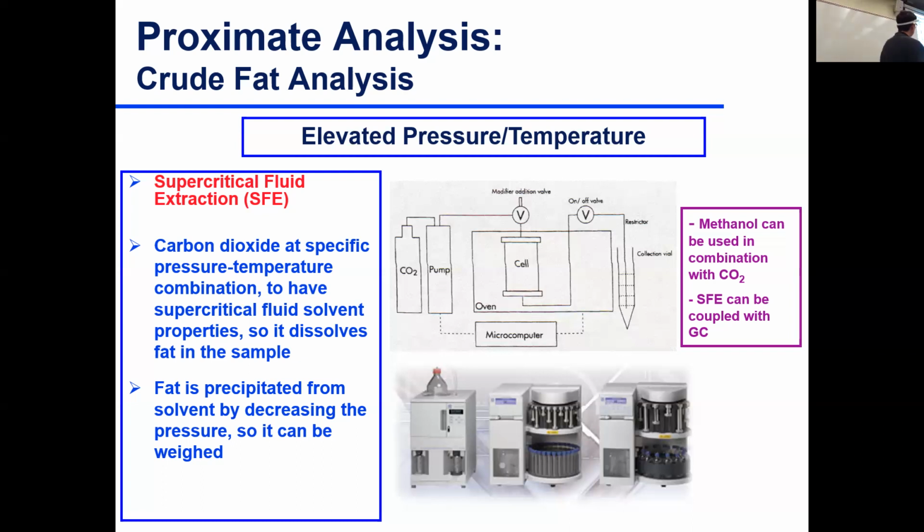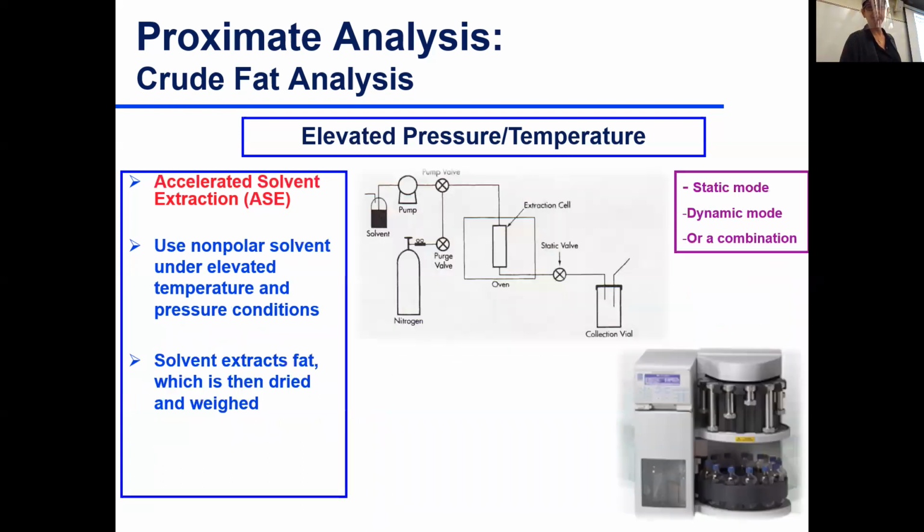I have a note here that it can be coupled with GC if we are extracting components that later on we want to analyze using gas chromatography. So supercritical fluid extraction can be coupled with further analytical tools such as GC.